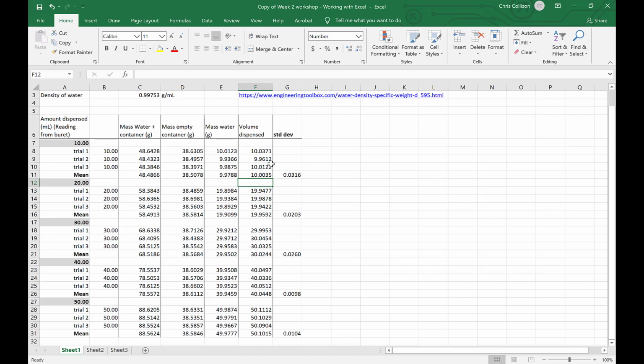But again, Excel is there to be useful and to create certain shortcuts, and those shortcuts work well so long as we know what we're doing. So we can use the average function in lieu of the sum divided by n approach. Let's stop there, and then in the next section we'll talk about how to plot this and how to plot a calibration curve that will help us determine how well the burette can be used in a particular titration experiment.